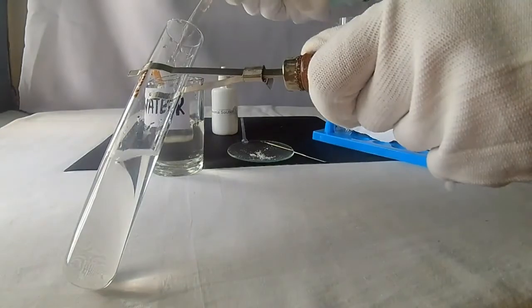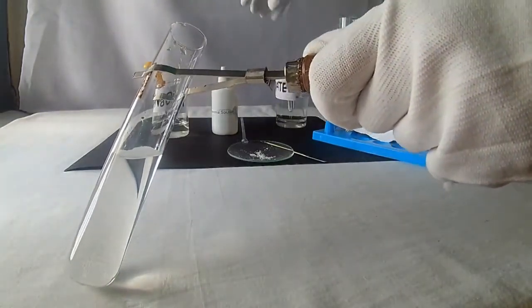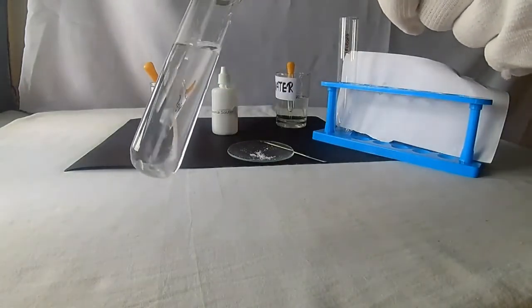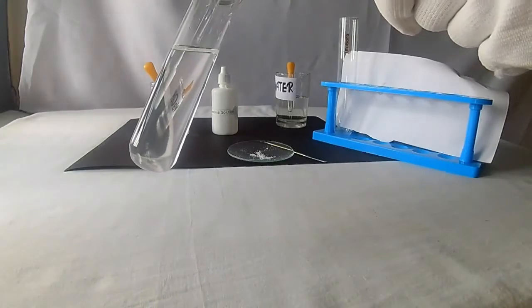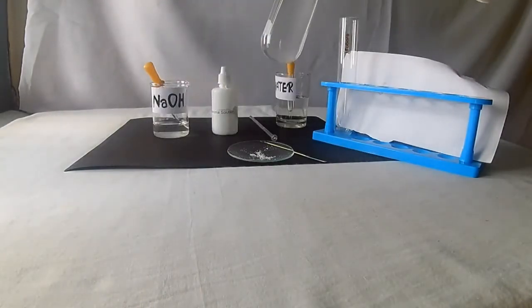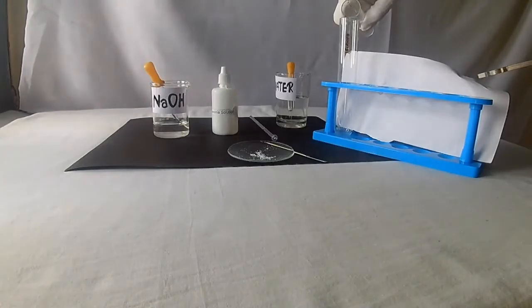Add about half a test tube of water to prepare the solution. Stir it well and mix the salt. Now the solution is ready. Divide the solution into two parts.